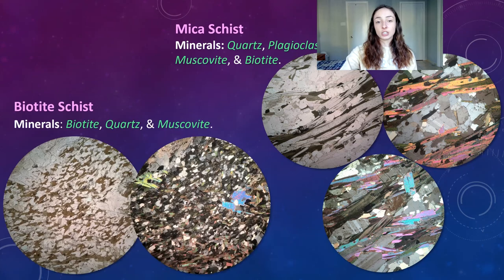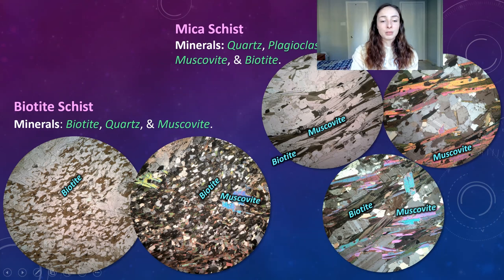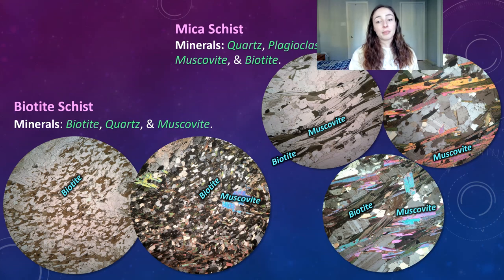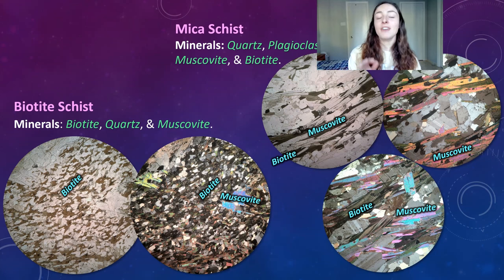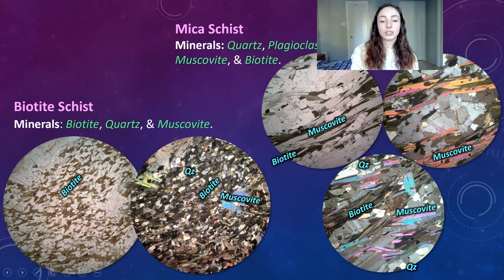Now another example: a mica schist and a biotite schist, to show the difference. I called the upper right sample a mica schist because it contains relatively equal amounts of both biotite and muscovite, whereas the bottom right sample contains a lot more biotite than muscovite, so I called that a biotite schist. You could just call it a schist if you don't want to get too fancy. Both samples contain quartz — you can see a lot of quartz in the matrix of biotite in the left sample. There's also a little bit of plagioclase or feldspar in the right sample, which you can identify by its distinctive twinning lines.